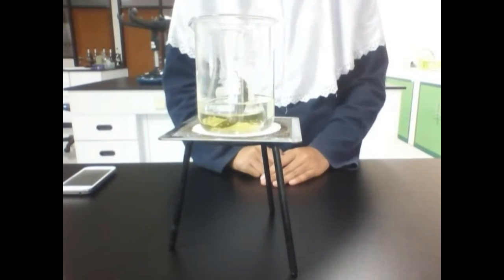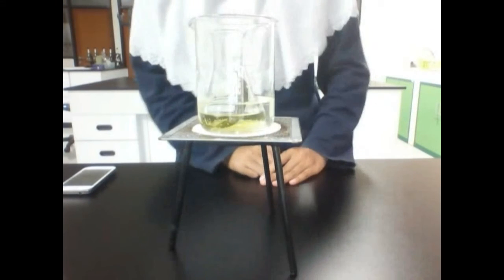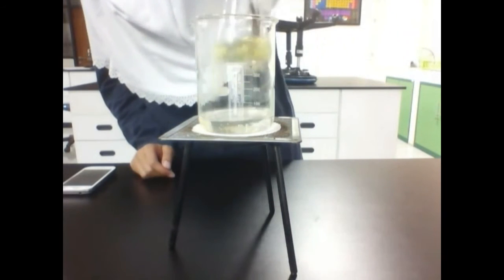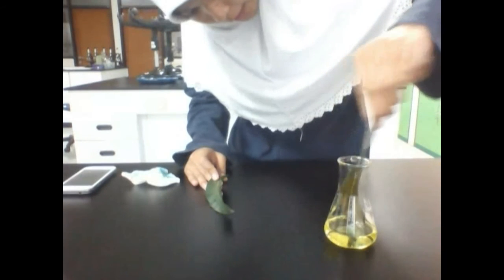This is the result of our experiment today, and as you can see on the screen, the alcohol has turned its color to green. Now we will see what about the condition of the leaves. It's green, right? And if we compare the color of the extracted leaves and the original color of the leaves, we can see the differences in color.